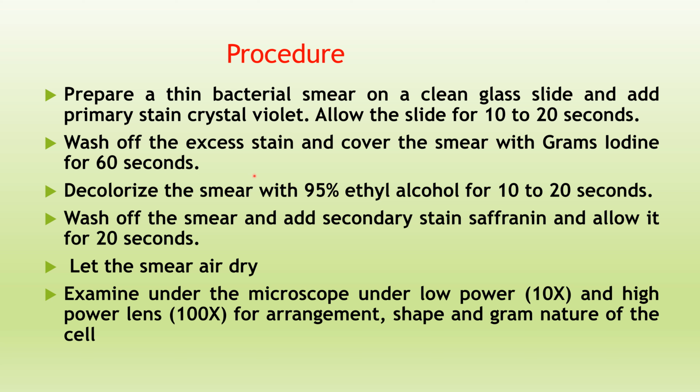Then after that, remove excess of Gram's iodine and decolorize the smear with 95% ethanol. This 95% ethyl alcohol will act as a decolorizing agent, and we need to leave it for 10 to 20 seconds. Just 20 seconds is enough. So wash off the smear and add the secondary stain, that is the last step, and allow it for 20 seconds.